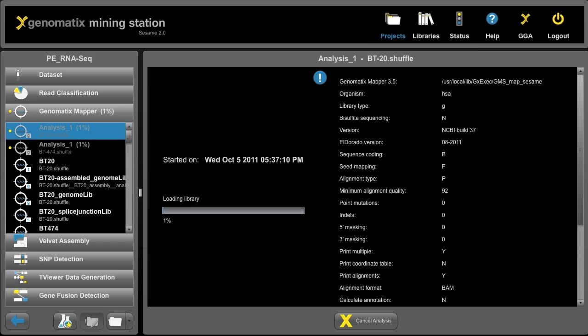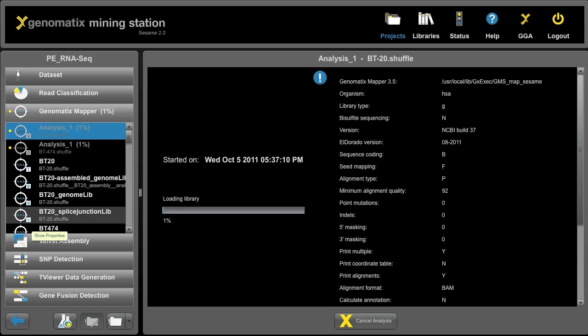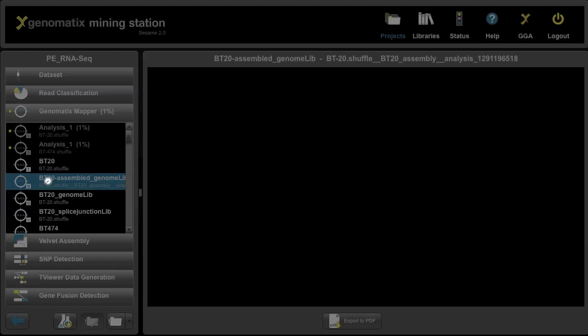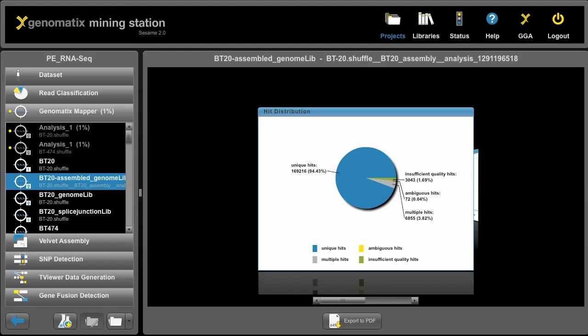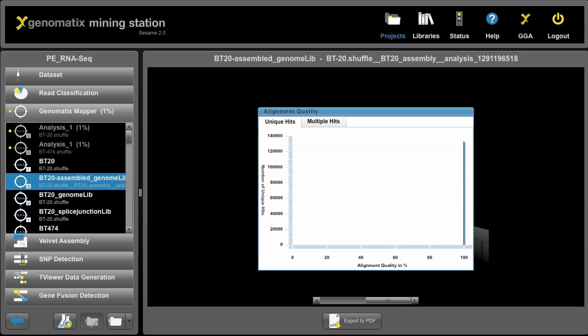Now these mappings will take a little while so we can have a look at the mappings that have run prior today. Here we can see we have a mapping against the transcriptome, a mapping against the genome, and a mapping against spliced junctions. We can click on any of these mappings and then get statistics about the results. For example, here we have 94% unique hits and these tell us how many hits were multiple and how many were insufficient. And we can also look at the quality of the unique hits and of the multiple hits.